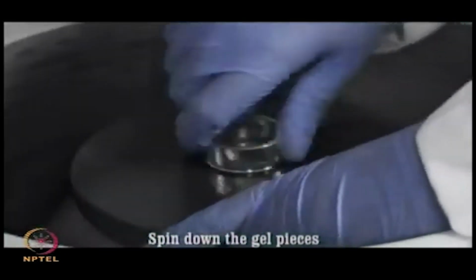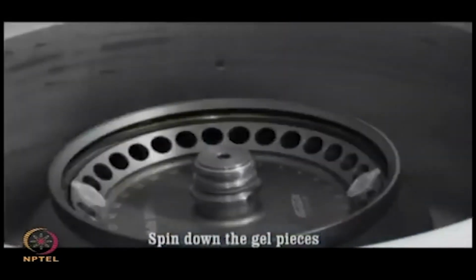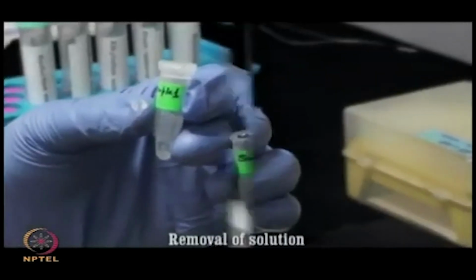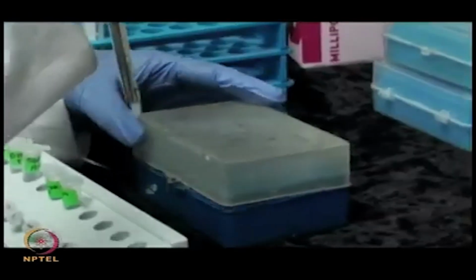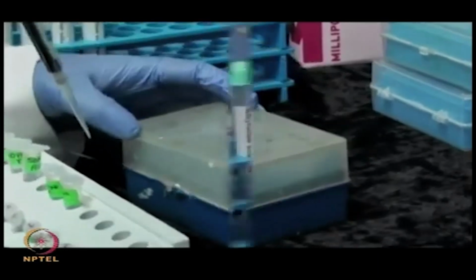Once centrifugation is complete, remove all the liquid. After removing the solution completely, add reduction solution.